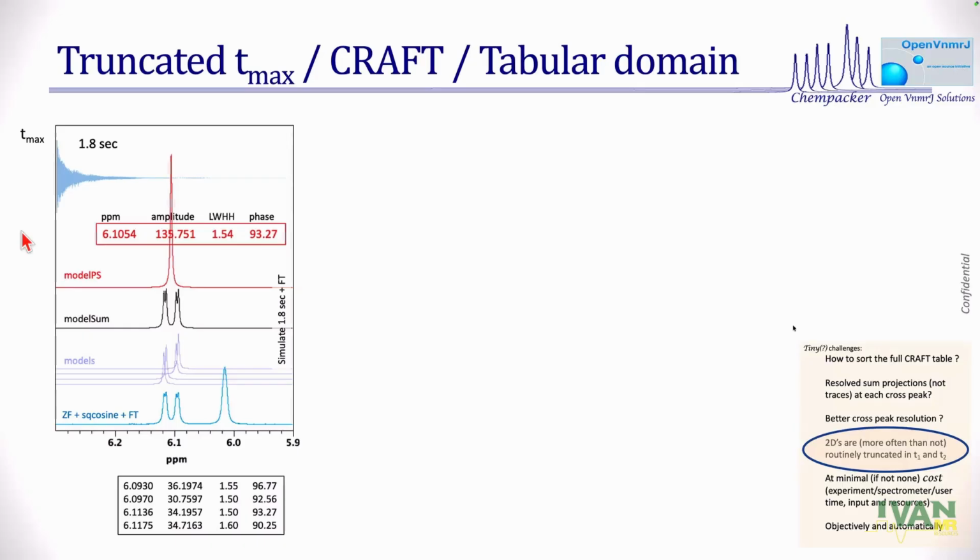Okay, so I'm going to now go faster in our process. Here is my FID spectrum. I take that FID, put it into my CRAFT machine, we generate a CRAFT table, and then I sort it. I sorted it, yes, because it's a baby step. I know what I'm looking for. So here is a sorted quartet, a doublet of a doublet. Just to alert you, the workflow or the data flow from there to here is CRAFT with the sorting.